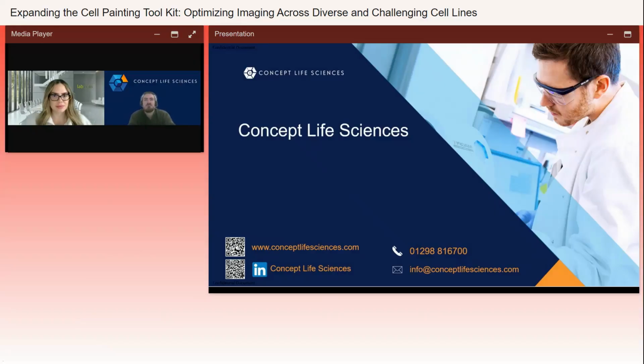I know there's some literature regarding live cell painting, although it's not something I've really investigated at length. It's typically a trade-off with live versus fixed, in that you'll have less multiplexing capabilities and potentially you might get a lower resolution as well. So it can be done, but you've probably got a trade-off there.